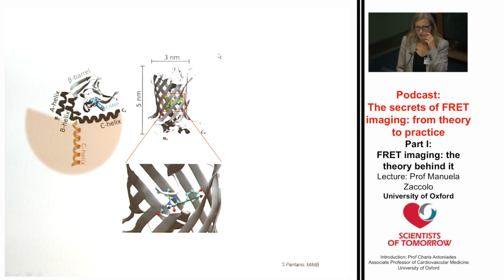The other consideration has to do with linkers. I mentioned earlier that linkers can be introduced between the detector domain and the GFPs, and this is often done to increase flexibility, to allow proper folding of the detector domain and to help release any steric hindrance that the GFPs can impose on the detector domain.